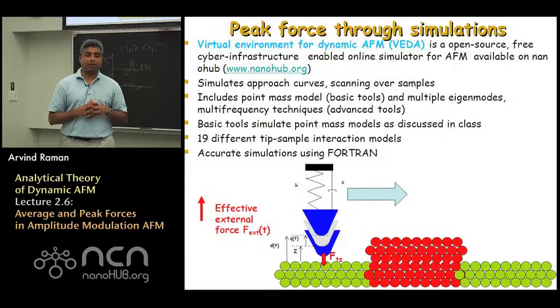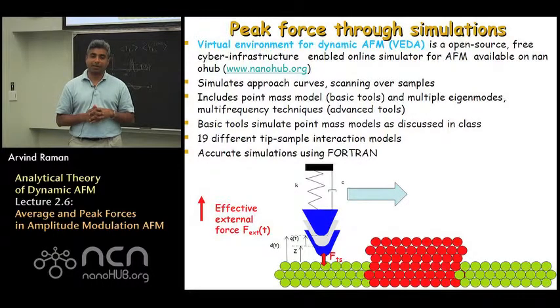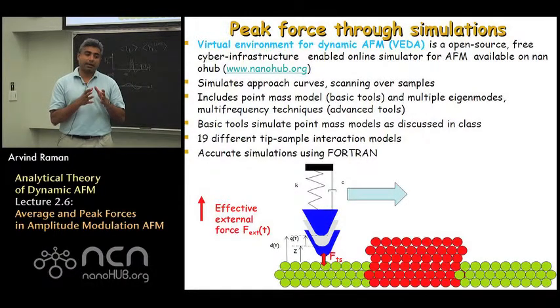To do simulations, one would resort to VEDA, which is the Virtual Environment for Dynamic AFM. As we'll be discussing in the next week of classes, it is an online simulator that's available to simulate not only dynamic AFM methods, but also static AFM methods. In the dynamic AFM methods, in the basic tools, it takes the point mass oscillator model with many kinds of tip-sample interaction forces. It allows you to construct samples with different tip-sample interaction force profiles in different locations, scan them at different proportional integral gains, or approach them with different operating conditions, and so on. And it's a Fortran-based code, so it's very accurate, and as I mentioned to you, it allows a very large number of tip-sample interaction parameters.